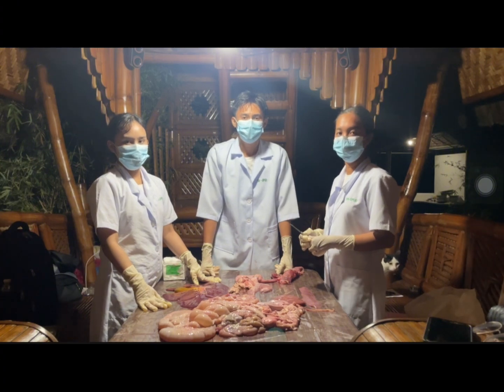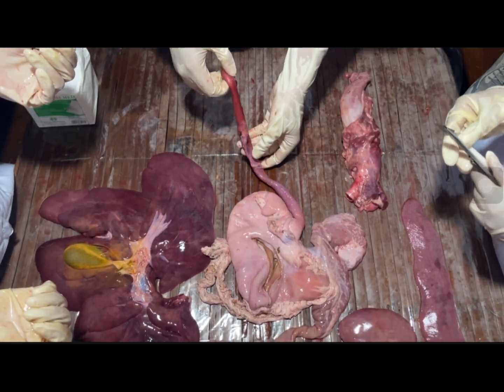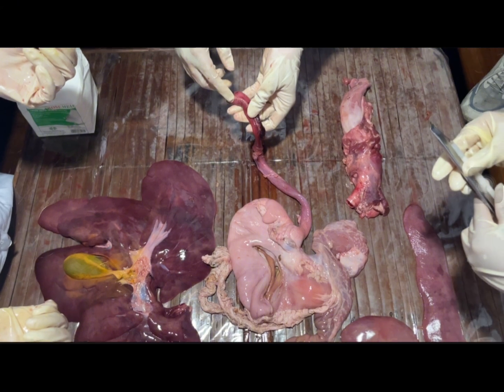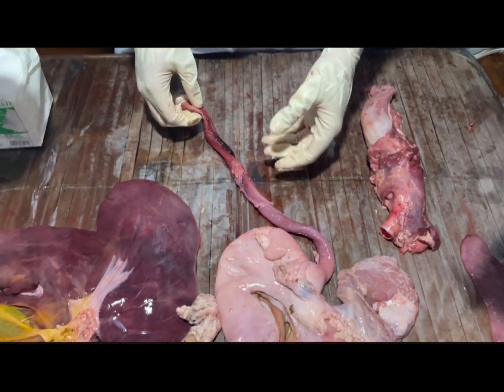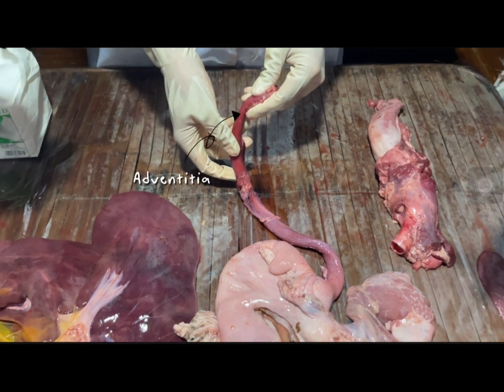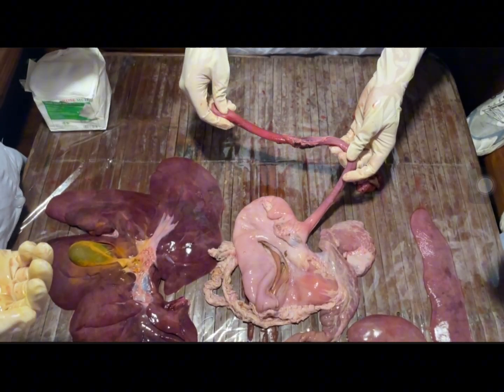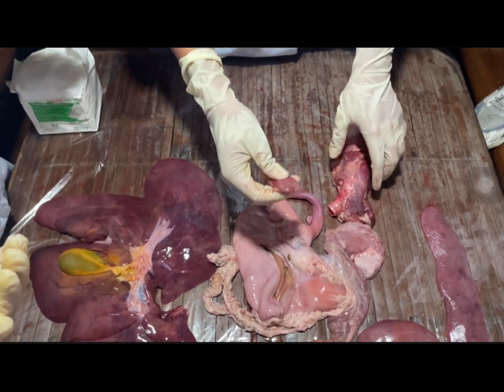Now we'll begin with the esophagus. First, let's observe the outer structure of the esophagus. Notice its long cylindrical shape and its slightly elastic texture, allowing it to accommodate food of varying sizes. Here we can observe the outer layer called the adventitia, which anchors the esophagus to nearby tissues. Notice its elastic, flexible structure which allows it to expand and contract during swallowing.